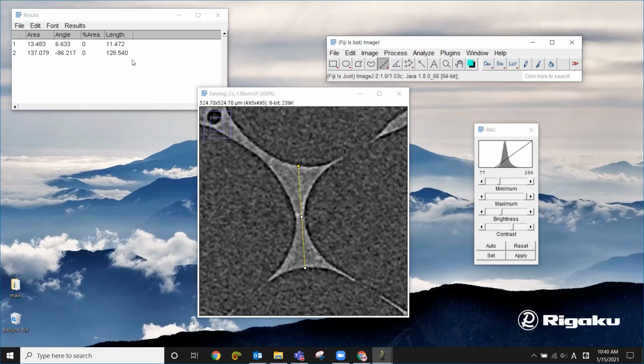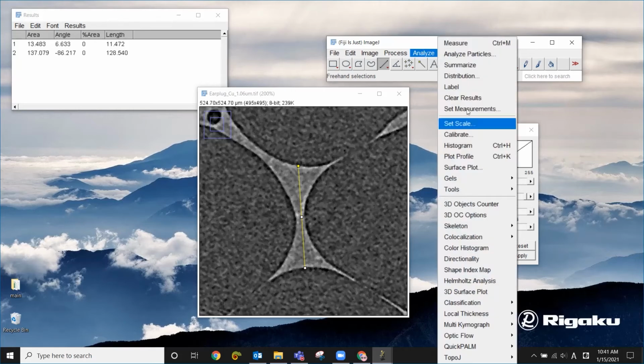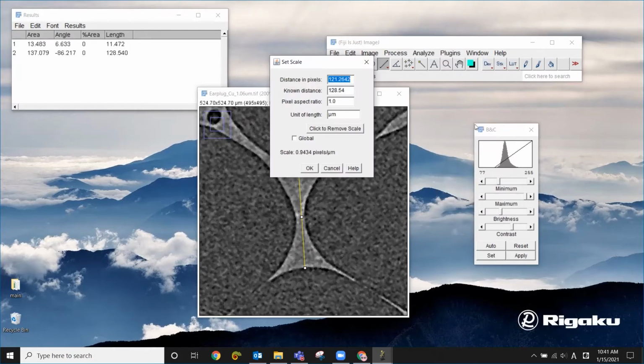And to get those scales right, the length of measurement right, by the way, ImageJ needs to know the size of one pixel or voxel. If you just open a file that doesn't have header information to define the pixel size, then those measurements would be wrong. So if the voxel or pixel size information is not in the header, you can go to Analyze and Set Scale.